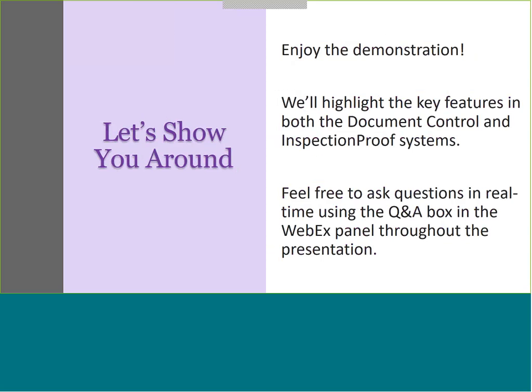So now I'm going to get into the actual software and show you around a bit. We'll highlight some of the key features in both systems. And again, just a reminder, please do feel free to ask your questions in real time now. There's a Q&A box in your WebEx panel. So at any point throughout the presentation, if a question pops up, please do go ahead and type it in that box and we'll get you an answer right away.